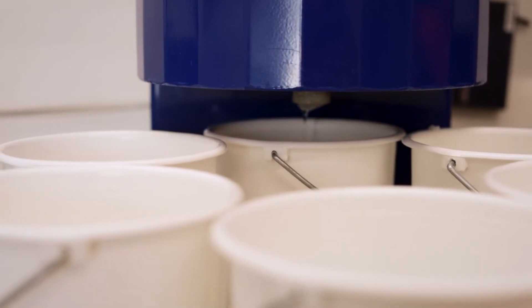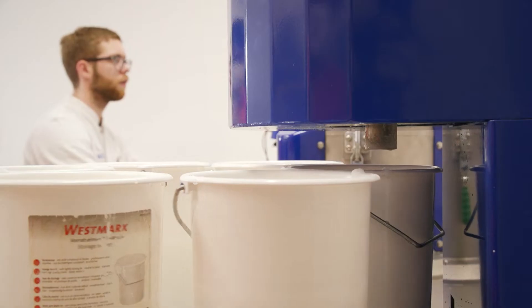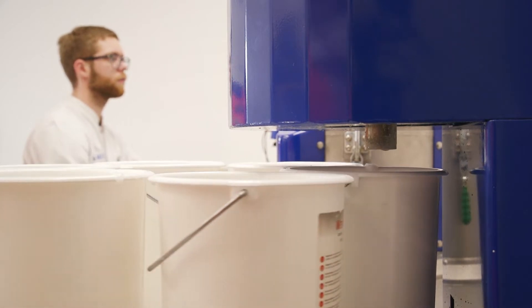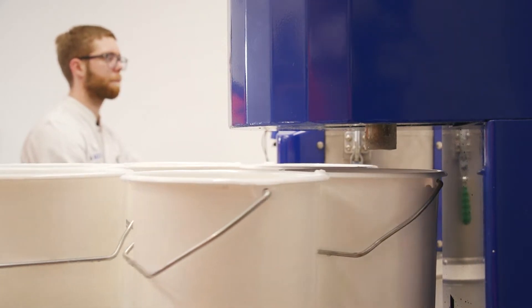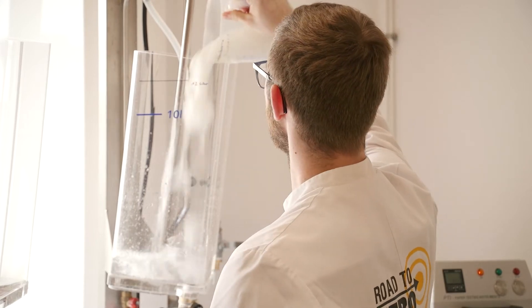Up to six samples can be taken. At the end of the experiment, the emptying and rinse program starts. Now the main work in the laboratory begins.